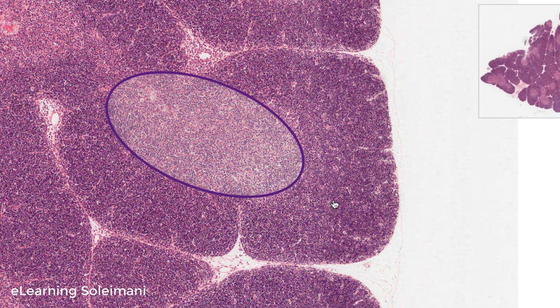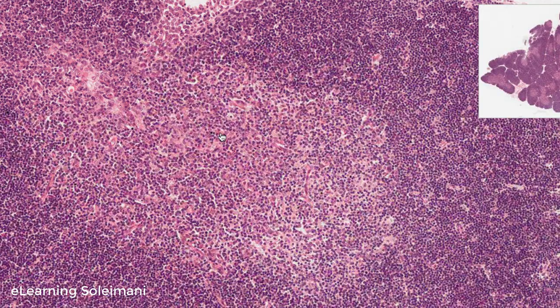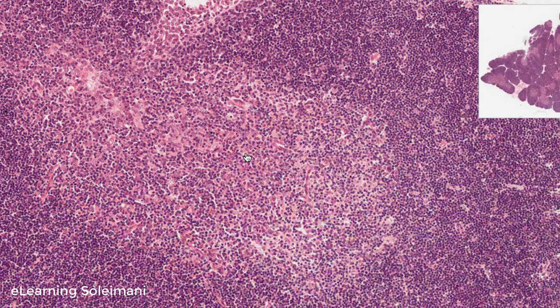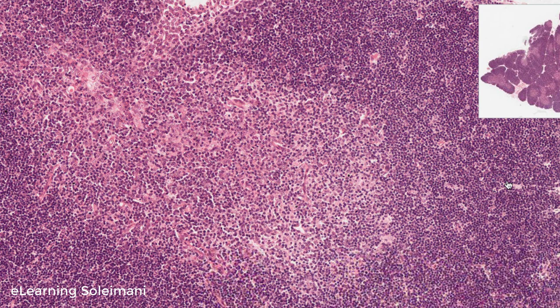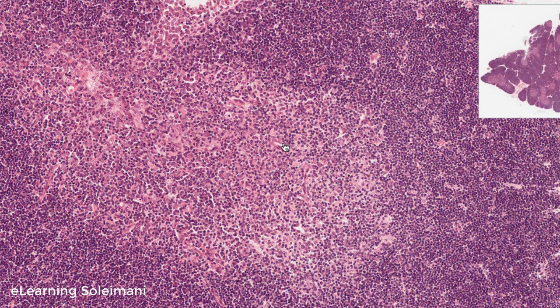Here we can see the lighter medulla. It is lighter because the number of cells that reach the medulla from the cortex for the final step of differentiation is low. Most of them undergo apoptosis in the cortex, and those cells that have gained receptors enter the medulla.